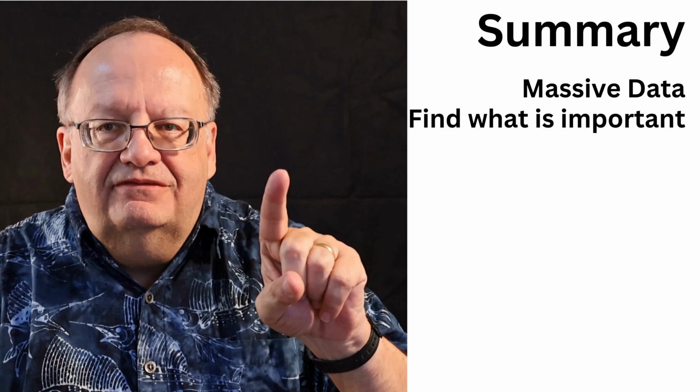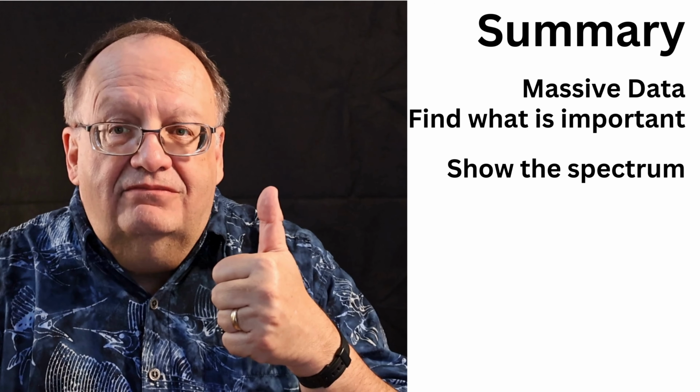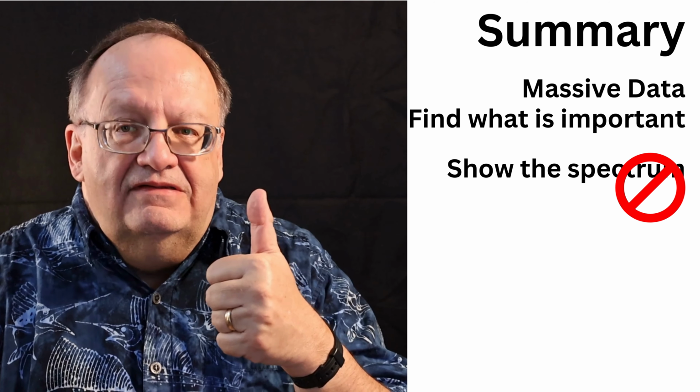Let's summarize where we are. We've got massive amounts of data, lots of it, and we've got to find out what's important to our biological question. Now, a common technique is to put up the spectrum. Well, that's a lot of manual labor, and we're talking about millions and millions of pieces of data that we've got to sift through. This is not a great idea.